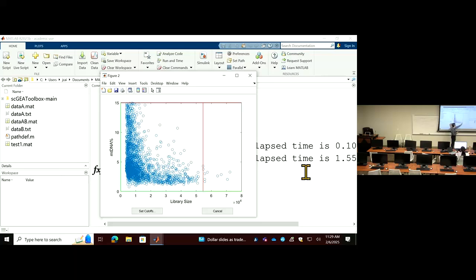So we set a cutoff. You can select any cutoff. You don't want to throw out too many cells, but you can see that those ones are suspiciously doublets or triplets, maybe unusually high. You can set the cutoff here. If you're higher than this, I will remove you. You keep all the regular cells in this range. You don't want it to be too small either, so you have 500 or 1,000 as the cutoff somewhere here, so that no cells have too small a library size. If too small, it indicates an empty droplet.